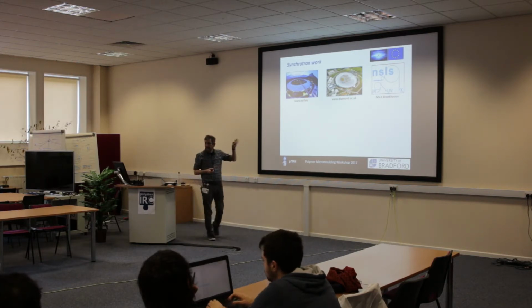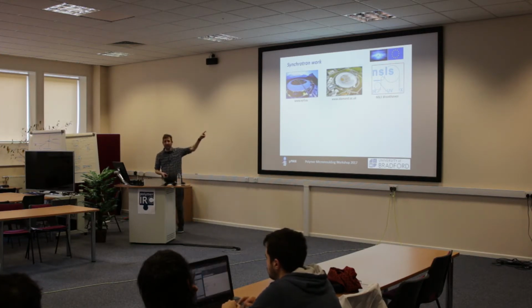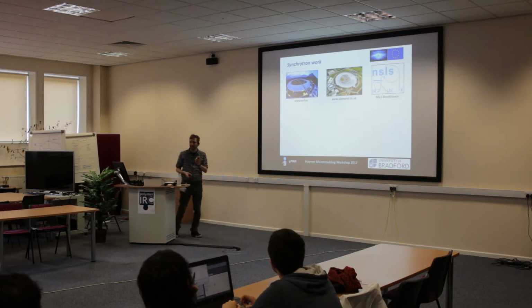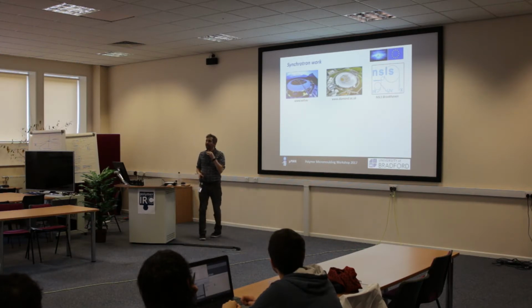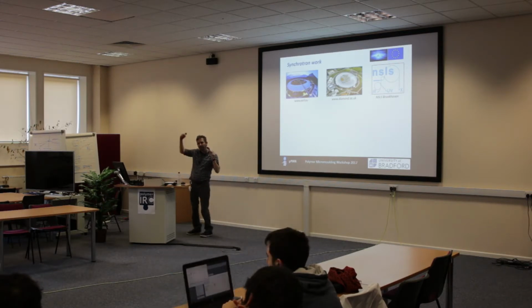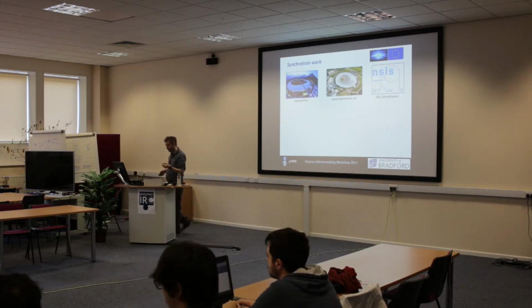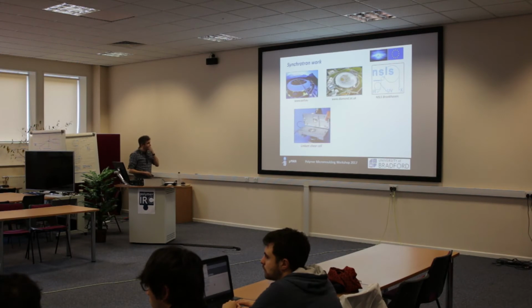The X-rays in here are 1 billion times brighter than those you get in dentists. So when you get your teeth done, they're X-rays, but these are real X-rays, 1 billion times brighter. By having this massive, focused intensity of X-rays, you can get a frame out at about 1 millisecond. So you can get your X-ray image while cooling, shearing, doing all sorts. And you'll see that has a real effect on the crystallinity itself.